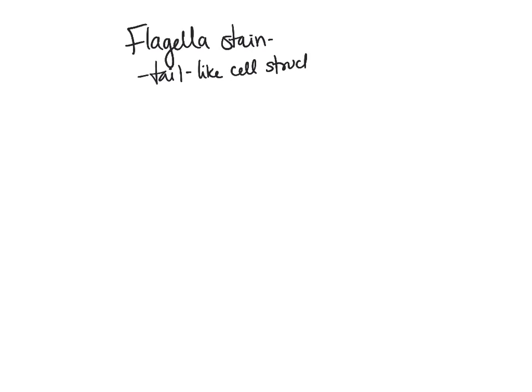All right, the next one is our flagella staining. So again, this is going to be able to identify our flagella. Flagella is our tail-like cell structure used for motion. And we can see some bacteria have flagella, which is plural, or a flagellum, which is singular. So that would be something else that could be used to identify.